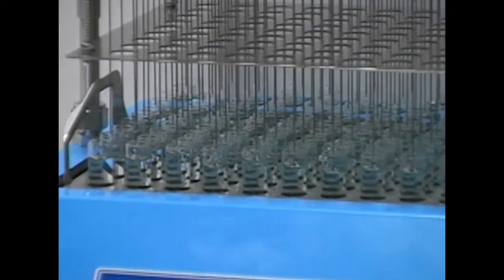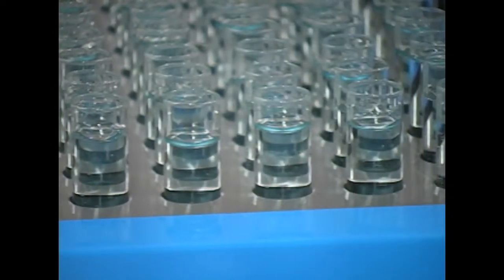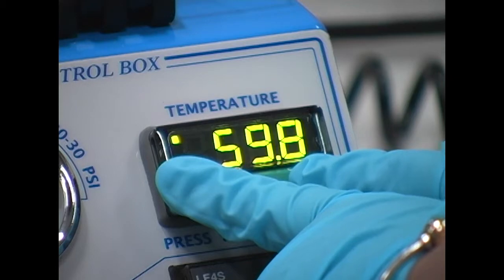The 100-position Multivap comes with a water bath which provides reliable uniform heat up to 100 degrees Celsius. The digital controller automatically maintains your chosen setpoint, ensuring consistent heating to delicate samples.